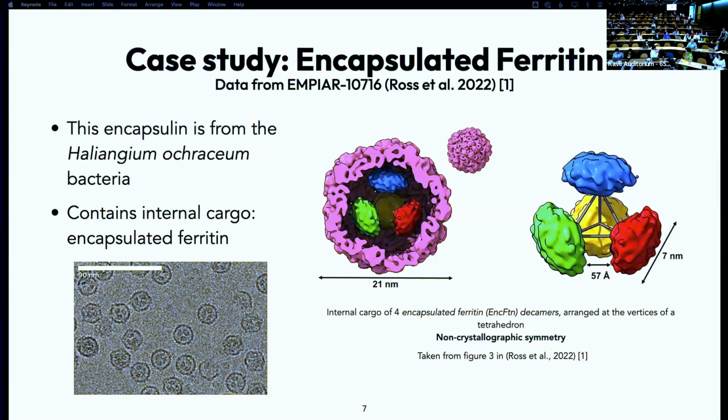You cannot tell the difference between version A and version B if there's such a tiny difference. The only hope you have is if that tiny difference also somehow, because of your chemistry or protein structure, whatever, is magnified into a larger conformational change across the entire structure. Even if that's just half an angstrom displacement of a whole bunch of atoms, if there's a ton of atoms that are in a slightly different place because of one amino acid difference, that becomes detectable because now the difference in the image between type A and type B suddenly becomes much larger. Even though it's a very minute atomic displacement, it becomes detectable. So that's really what it comes down to.